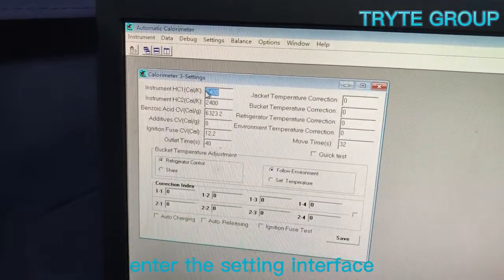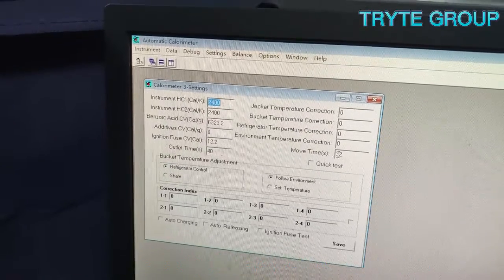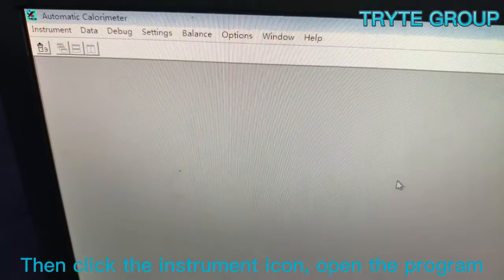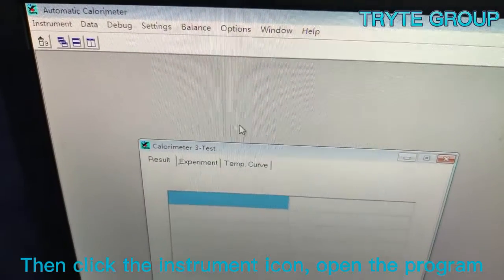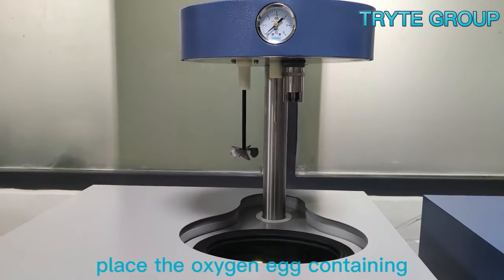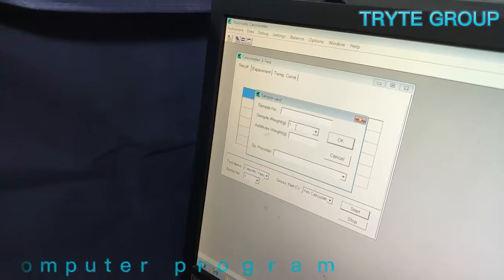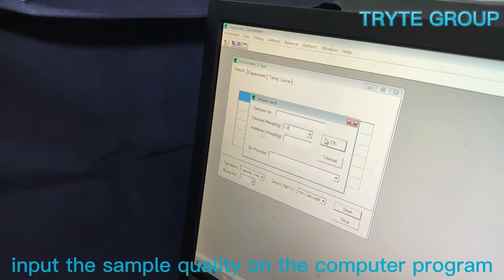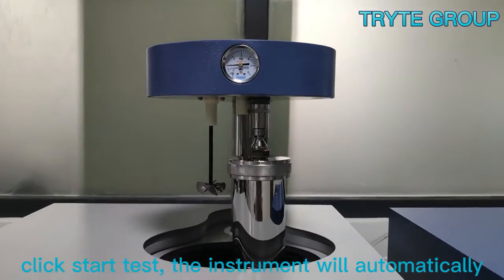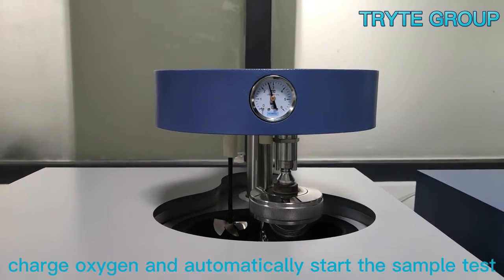Enter the setting interface, set the required parameters, and save. Then click the instrument icon and open the program. The lifting device will automatically lift. Place the oxygen bomb containing the sample on the lifting device. Input the sample weight on the computer program. Click Start Test. The instrument will automatically charge oxygen and automatically start the sample test.